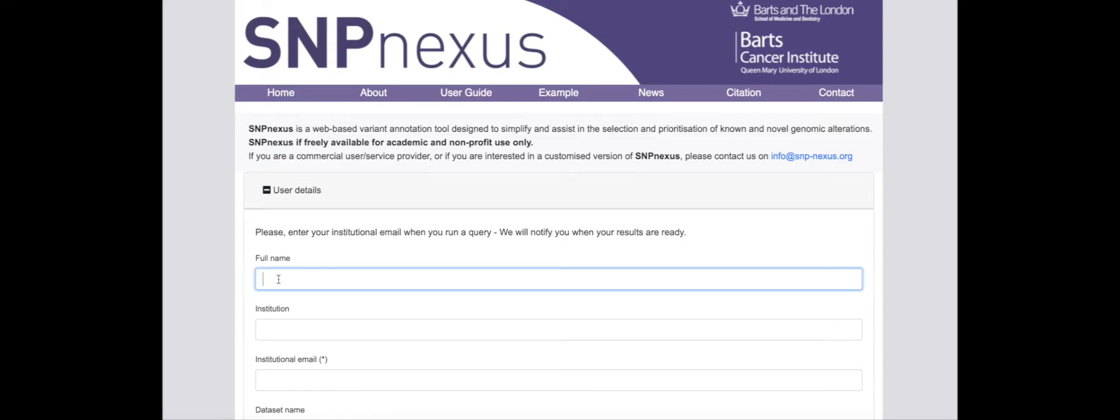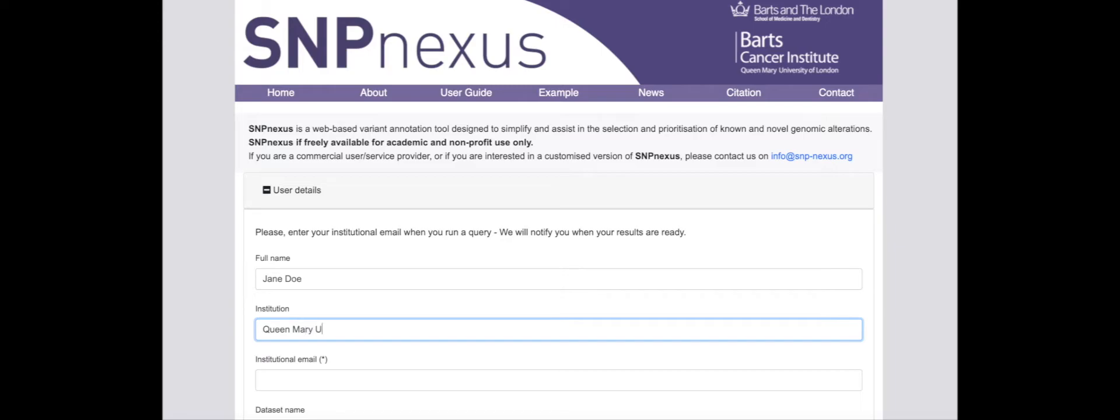A variant query can be started by providing contact details to receive a notification once the annotation process is complete for the uploaded dataset.